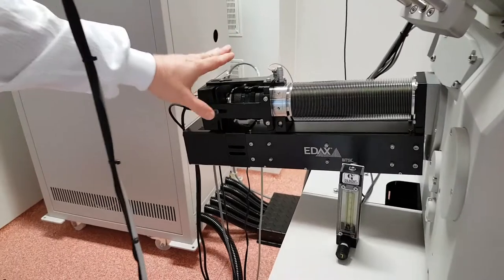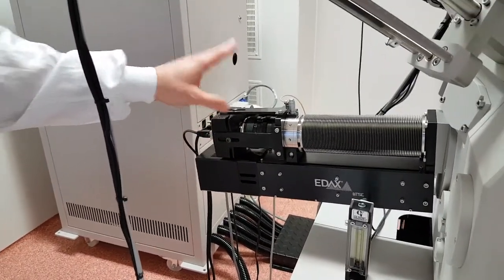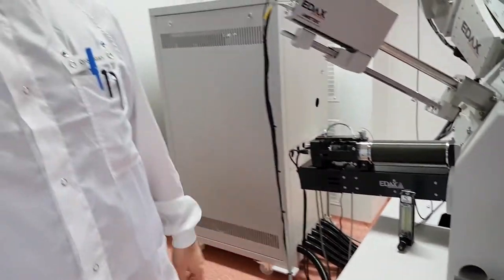And the one down there is? Electron backscatter diffraction detector. That one gains the crystallographic information. Yeah, yeah, yeah.